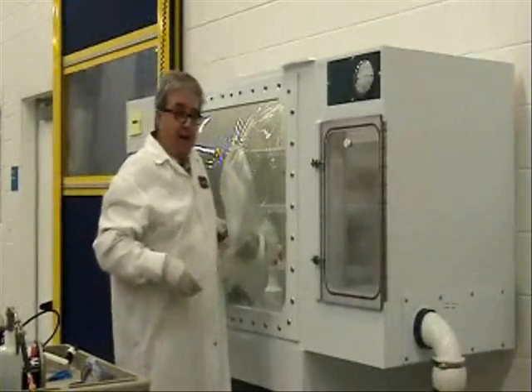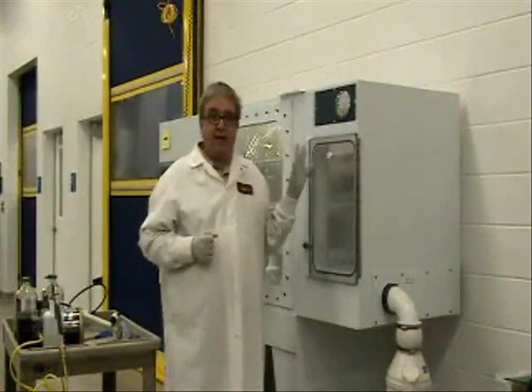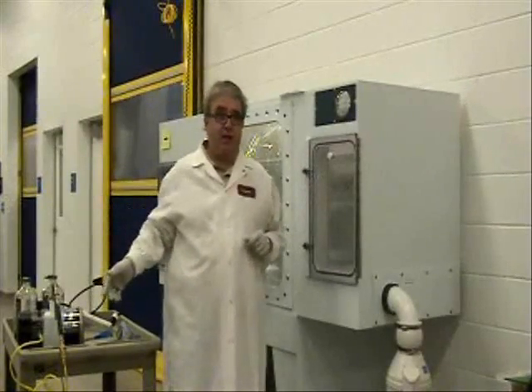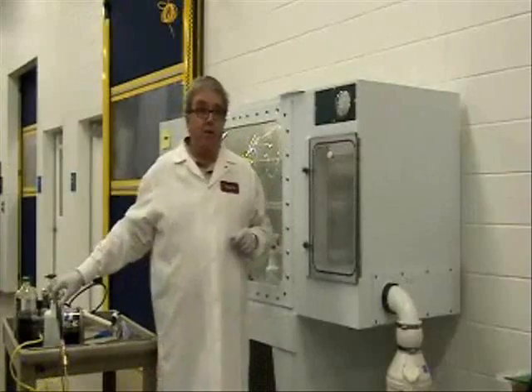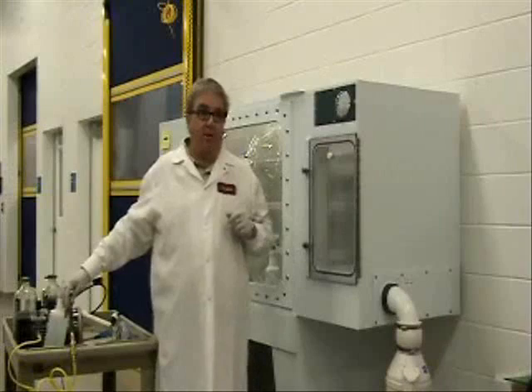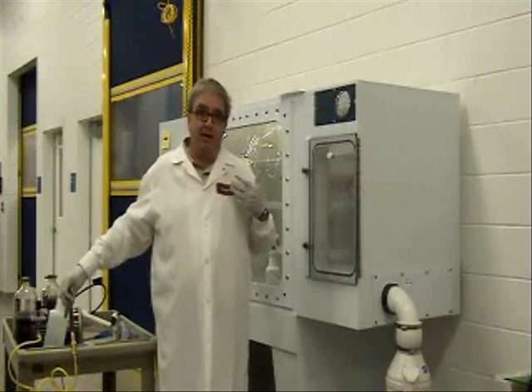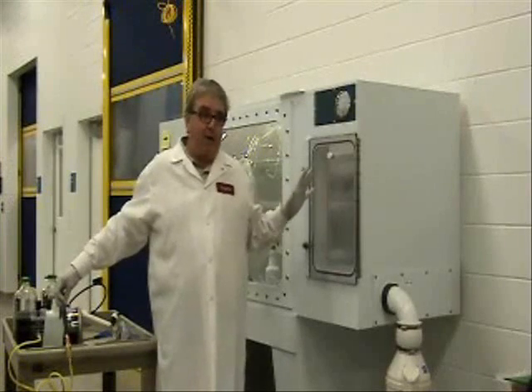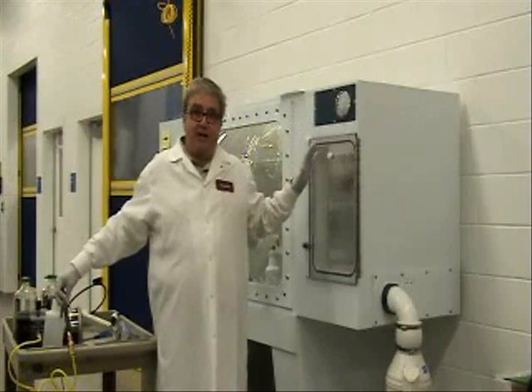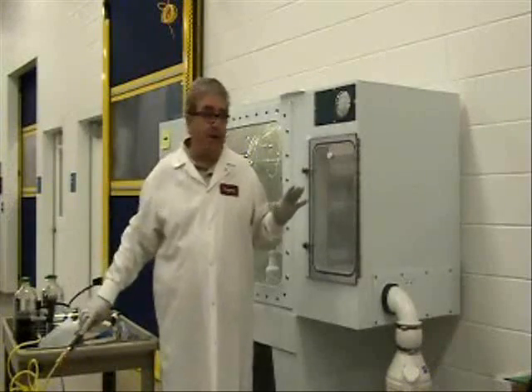One method I know Teconic uses is an initial spray-down with a hand sprayer followed by a secondary sterilization with the atomizer. You might think that's overkill, but if we're talking about germ-free work, it's particularly effective to get complete saturation of the isolator. What you would do is complete one sterilization, let it all set, and then do a second sterilization completely from scratch with the atomizer.